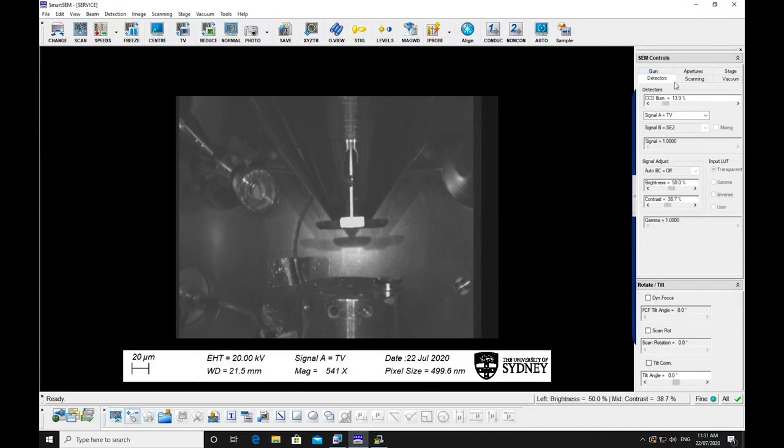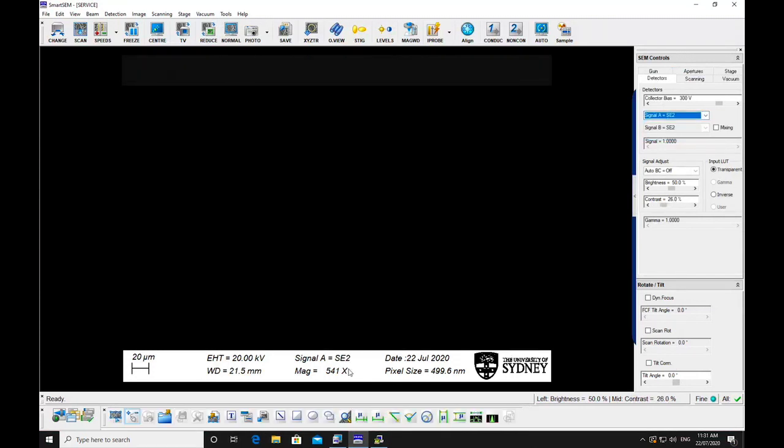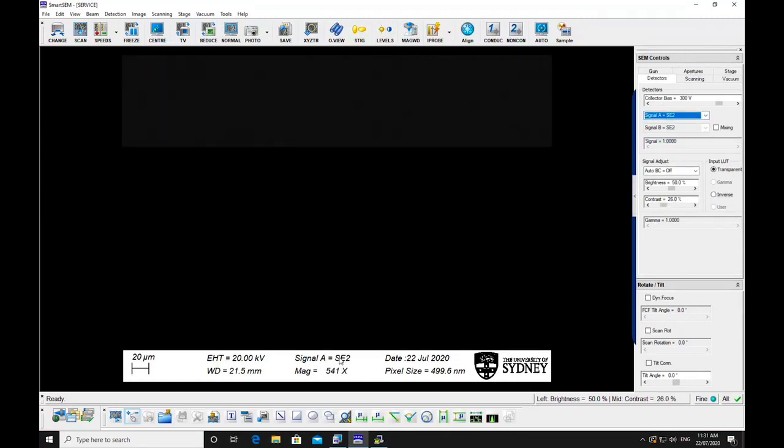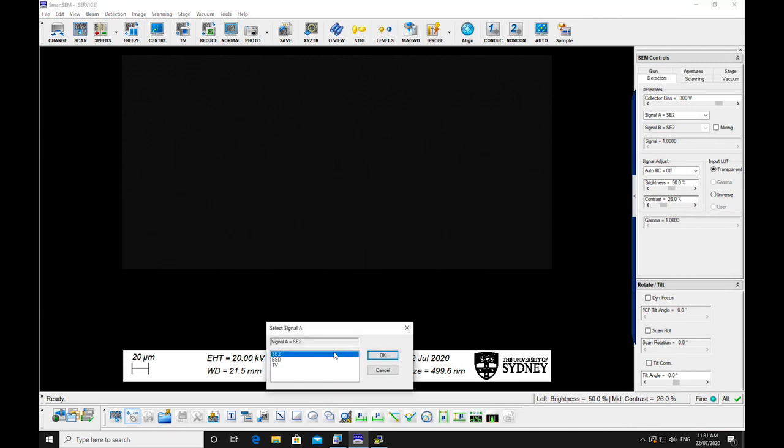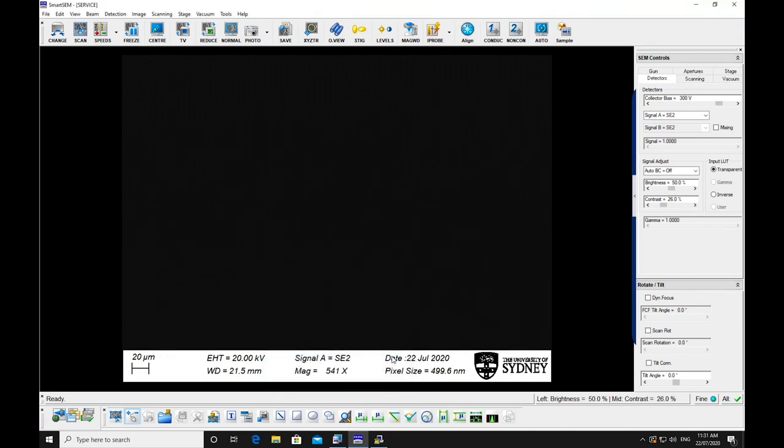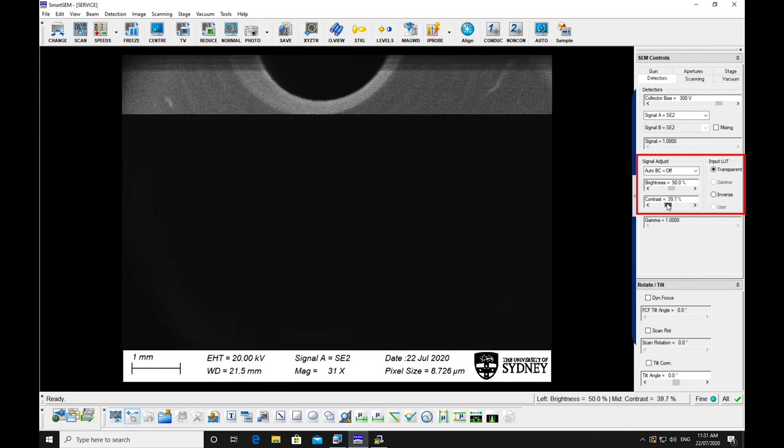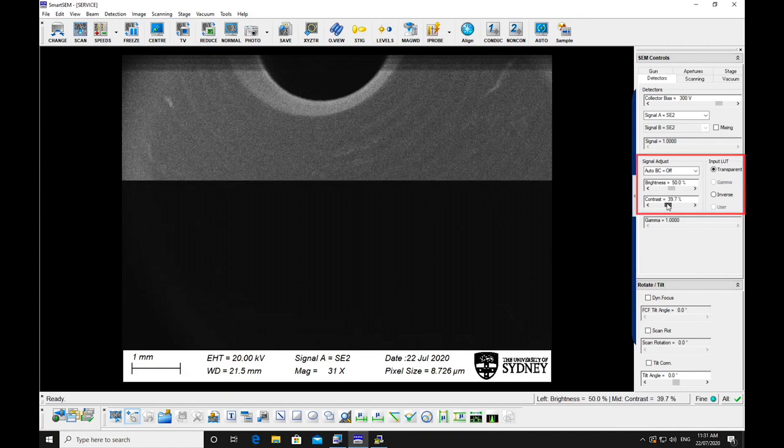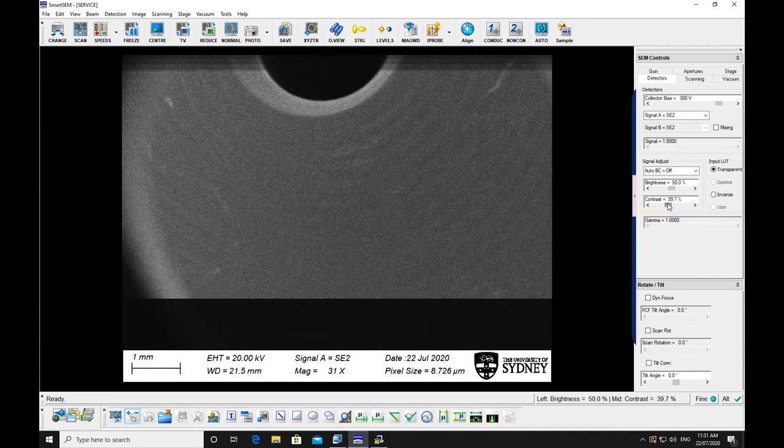Select the SE2 detector from the signals. Go to the lowest magnification. Set the brightness to about 50% and turn up the contrast until you can see an image. If nothing appears, you may need to move the stage slightly to bring the sample into view.